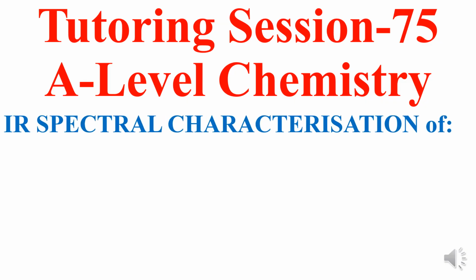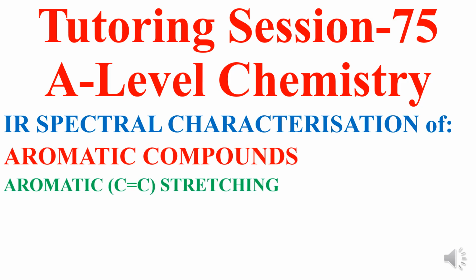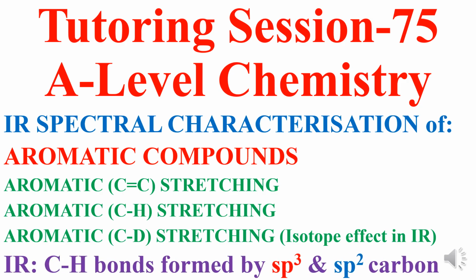In this video, I'll explain the IR spectral characterization of aromatic compounds involving aromatic carbon-carbon double bond stretch and aromatic C-H stretching. And I'll also explain the isotope effect in IR spectroscopy involving the aromatic carbon deuterium stretching. I will discuss the IR spectral peaks of CH bonds formed by sp3 and sp2 hybridized carbon.